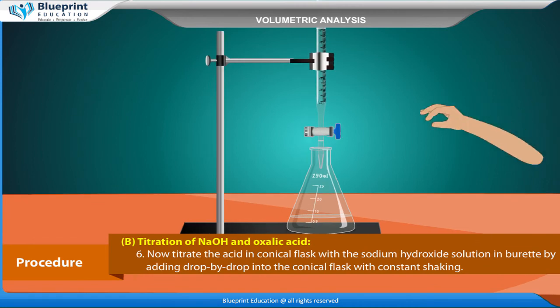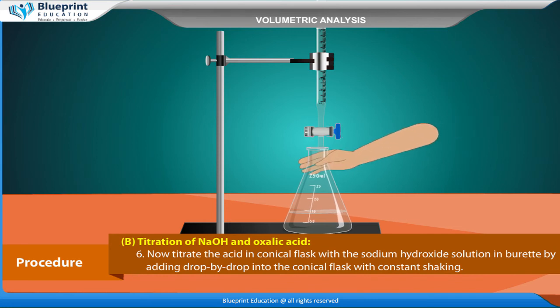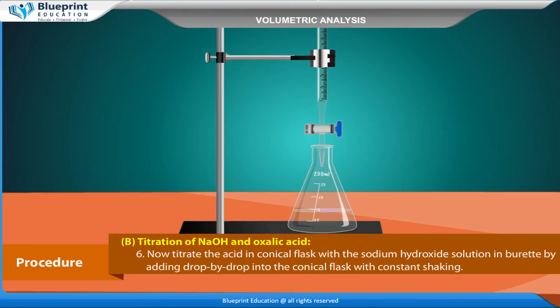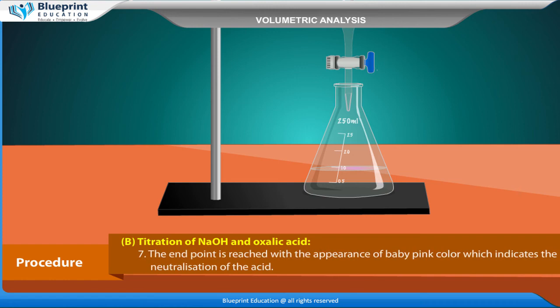Now, titrate the acid in conical flask with the sodium hydroxide solution in burette by adding drop by drop into the conical flask with constant shaking. The end point is reached with the appearance of baby pink color which indicates the neutralization of the acid.